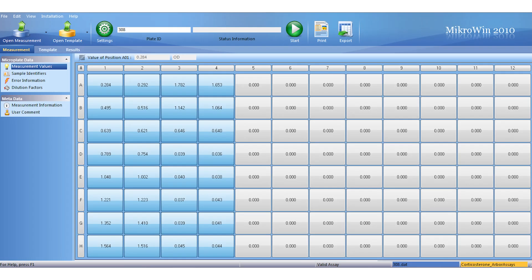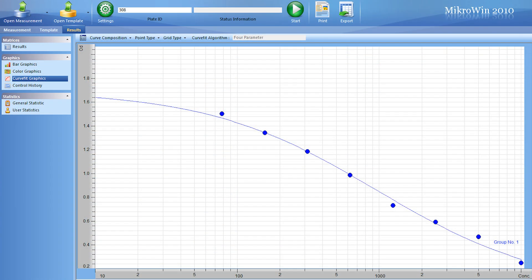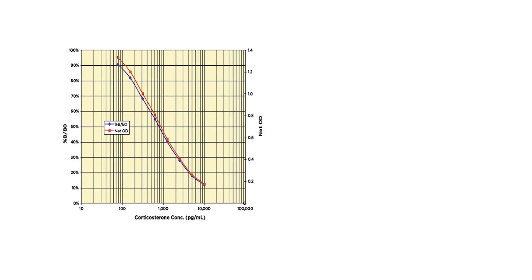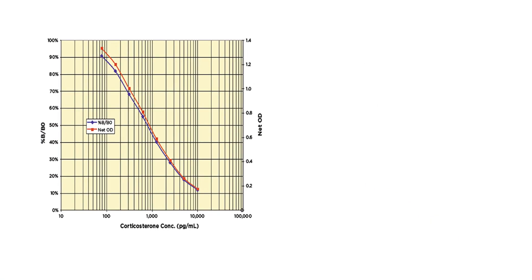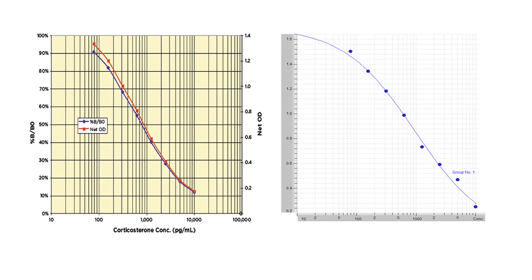We transfer our results to microwind data reduction software, where microwind generates our standard curve. Here we compare a typical normal range standard curve from Arbor Assay's Detect-X Corticosterone ELISA to the normal range standard curve microwind has generated.